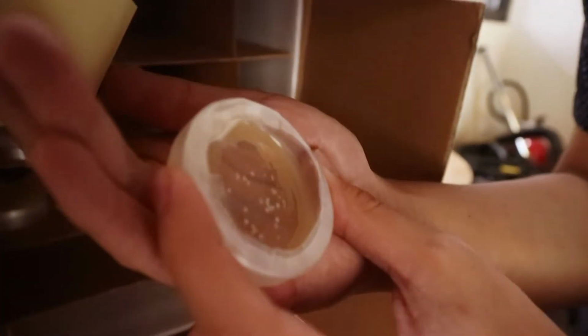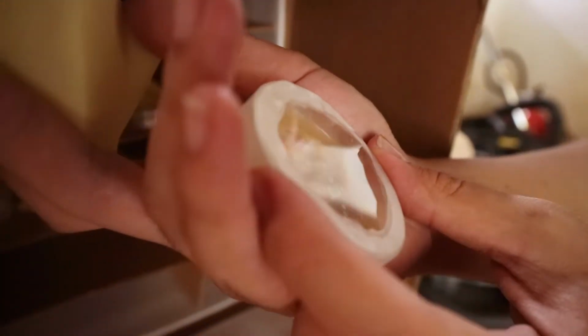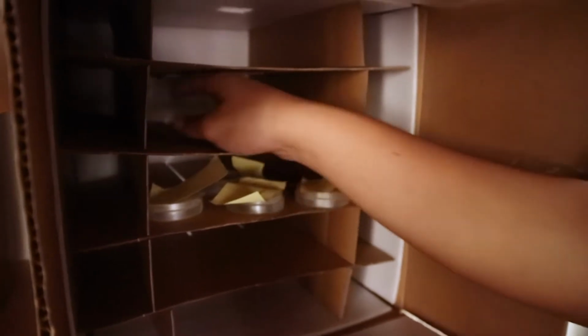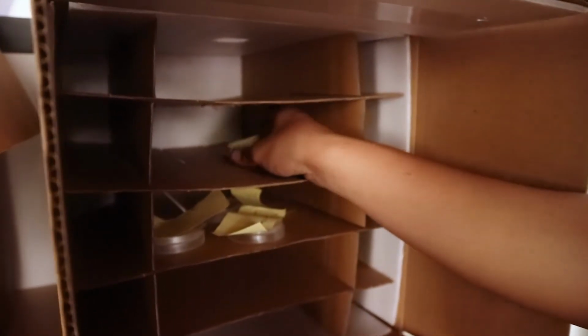You can see the yellow strain really clearly, and it dominates the whole dish in contrast with the other ones. And the spots of E. coli. Yeah, pretty dope. Pretty trippy. And what we're gonna do is we will collect all of these 8 dishes, and we are going to demonstrate how we draw bacteria from the samples of ready-made colonies.